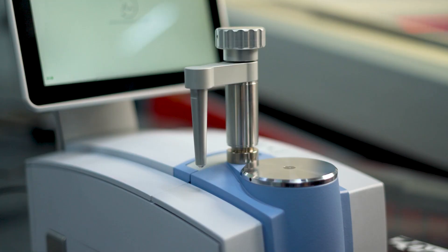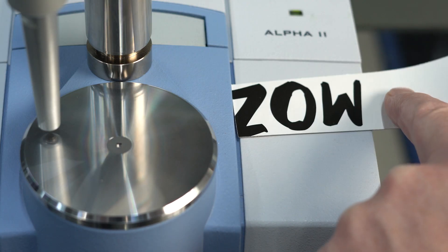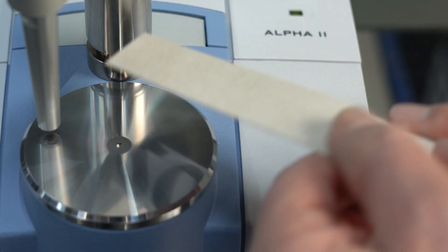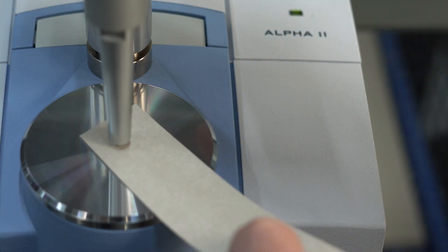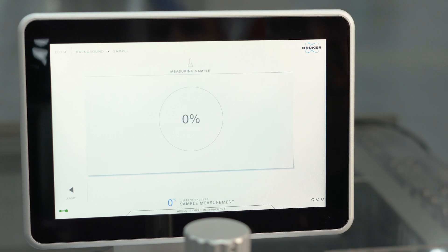The analysis is started with a few clicks in the software. We take a fresh print and place it face down on the IR measurement interface. Then we apply the pressure clamp to ensure tight contact. The Alpha 2 software outputs all the important data directly after the analysis.